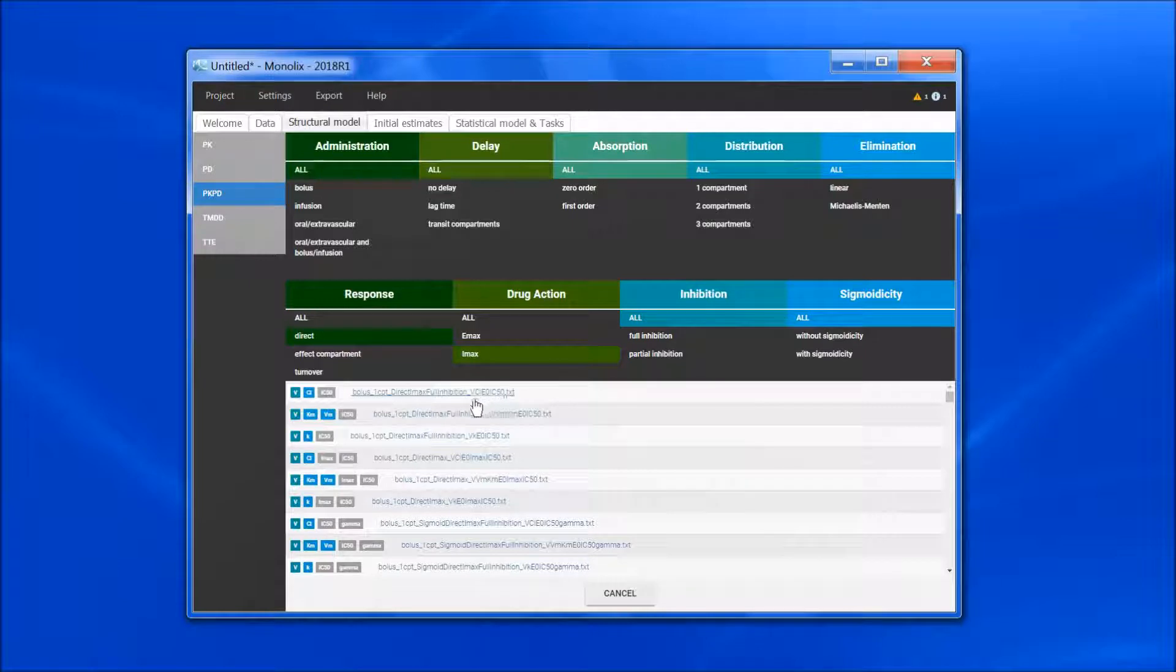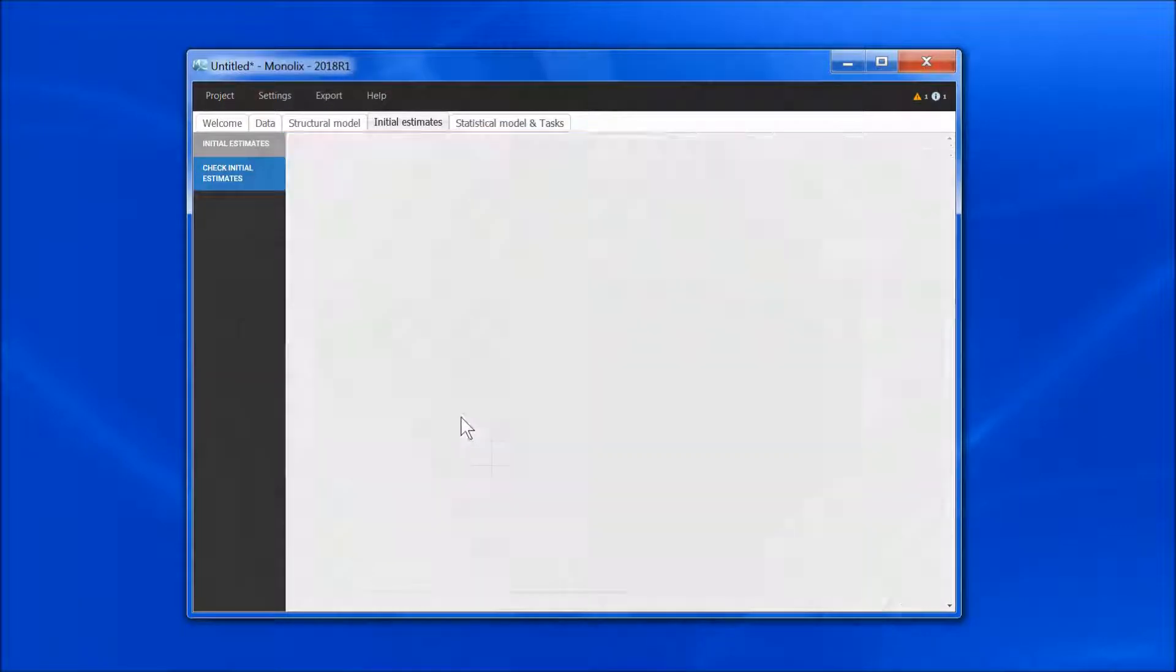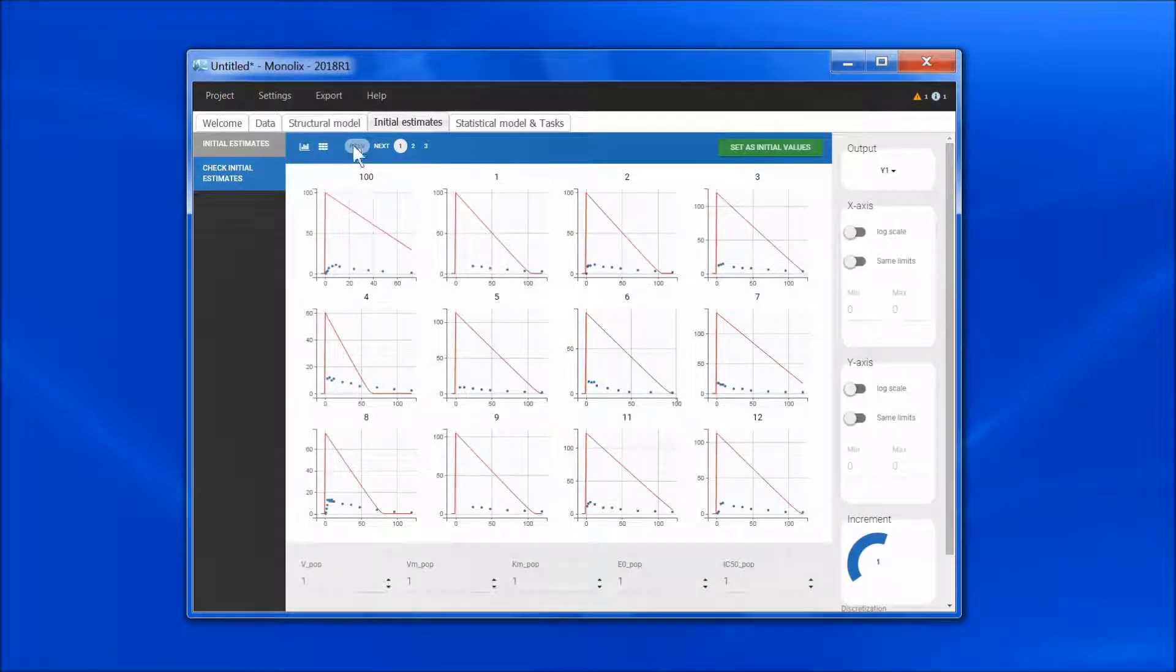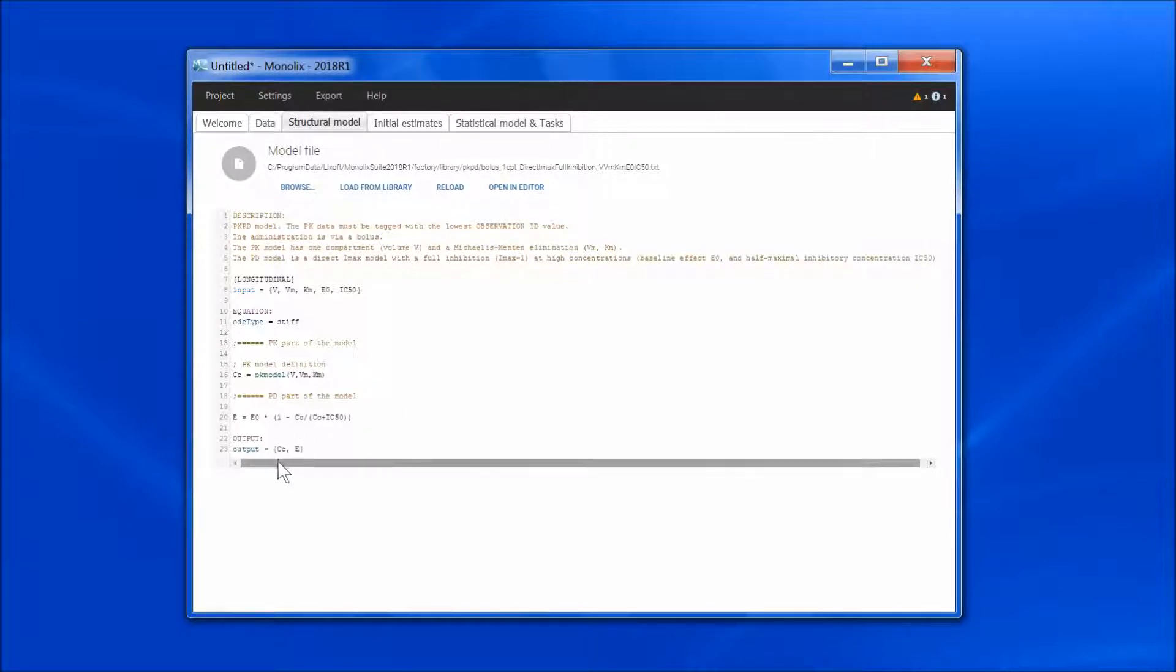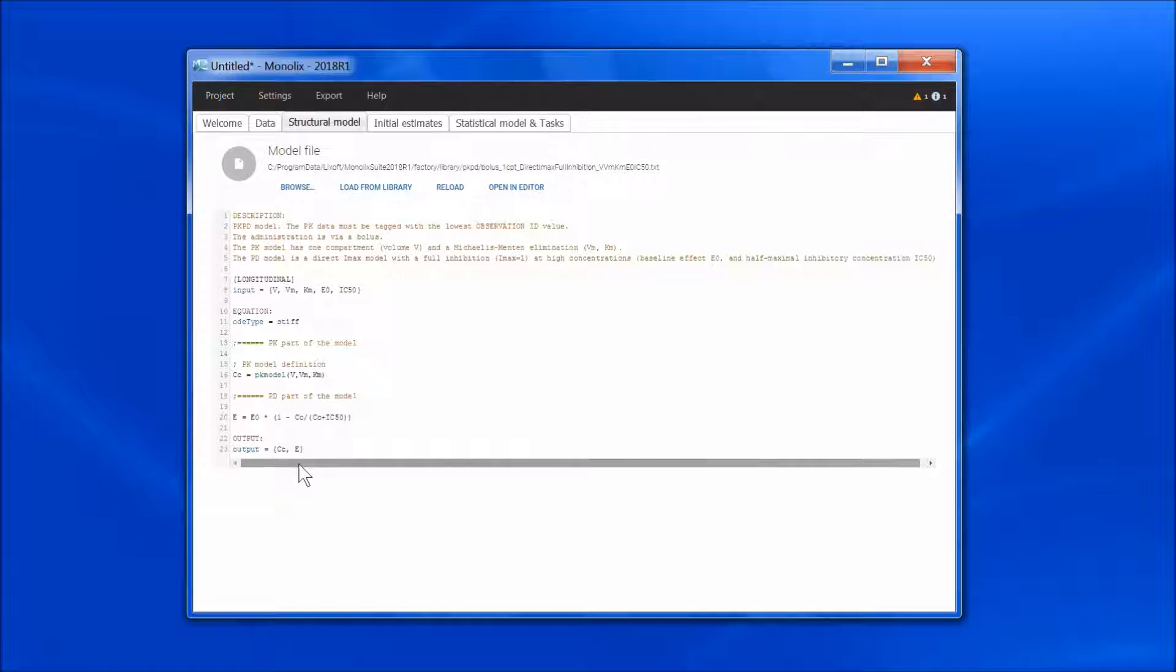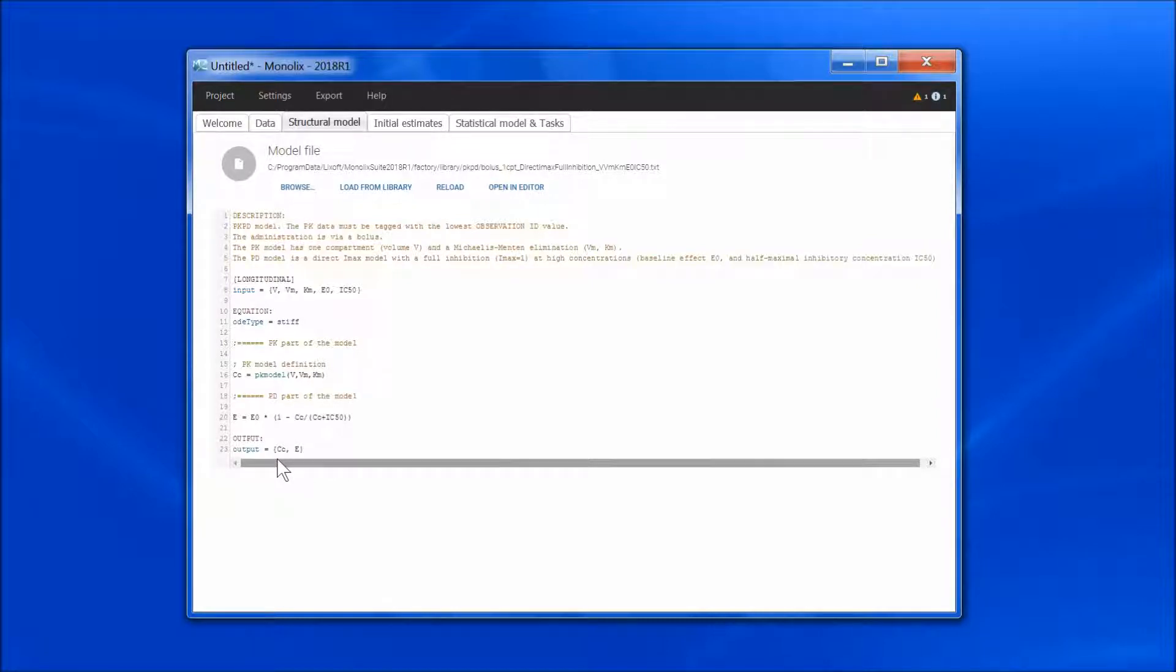If I choose a model, I see that I now have two outputs, the concentration CC and the effect E. For those models, the dataset requires an Observation ID column, and the first output, the concentration CC, will be mapped to the data with the lowest Observation ID value, usually Observation ID equals 1.